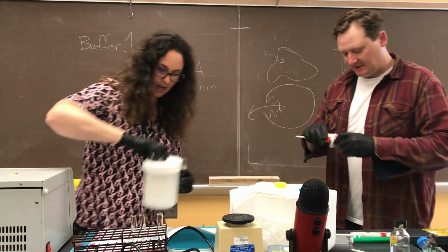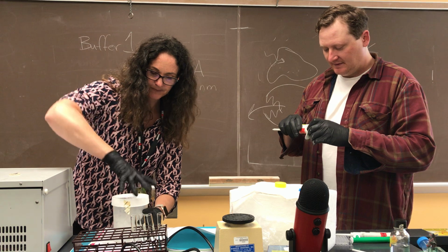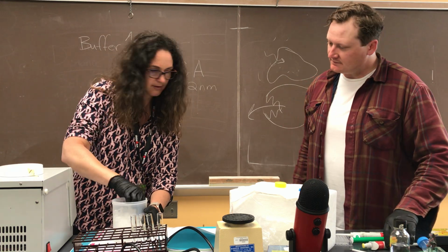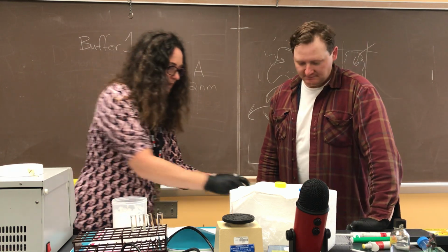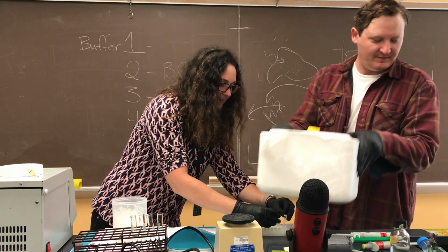Okay, so what we're going to do at this point is generate some standards.